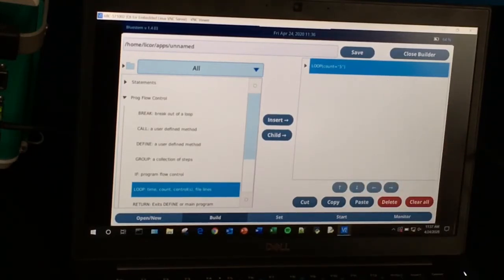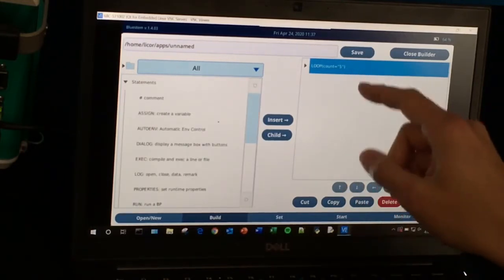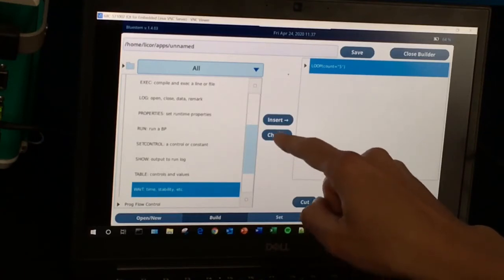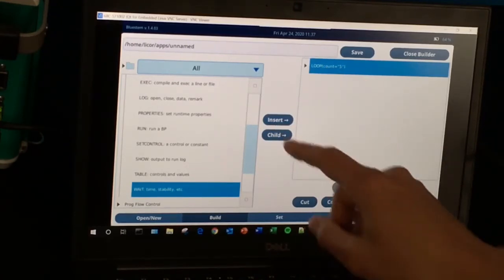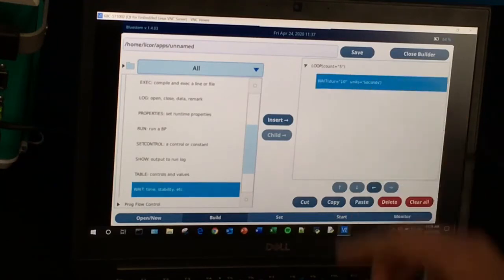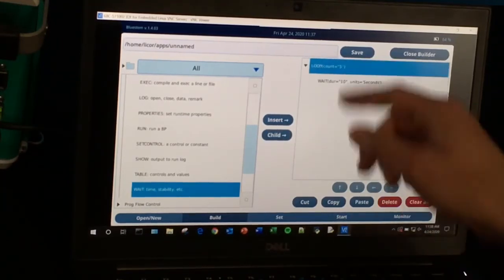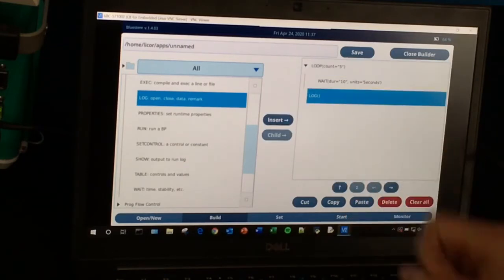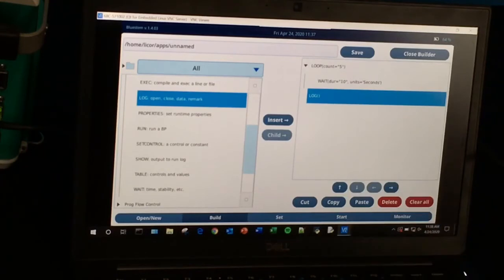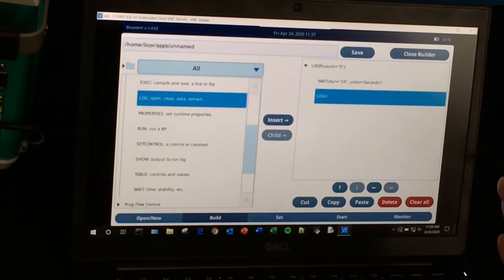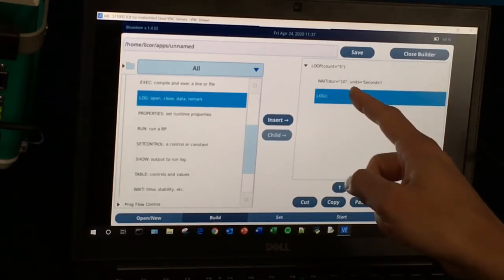Then I want to add a wait — I want it to wait for a certain amount of time inside this loop before it logs the data points. I'll go down here to the wait. There are a few different options, and I can use the Child button to put it inside this loop. If I click Child, it will add it inside. You can see that if I close my loop it will hide whatever is inside. Now I'll also add a log. If I just insert it without clicking Child, it will put it outside the loop, but I can always use these arrows to move it inside the loop.